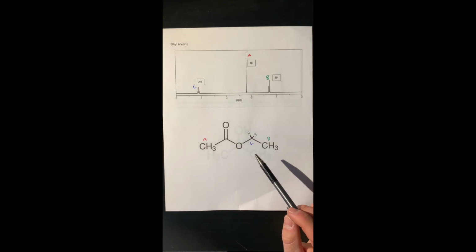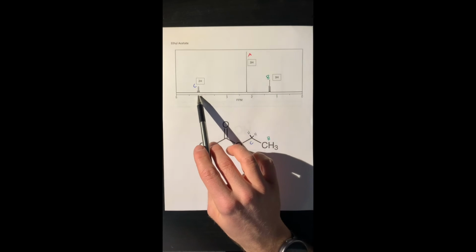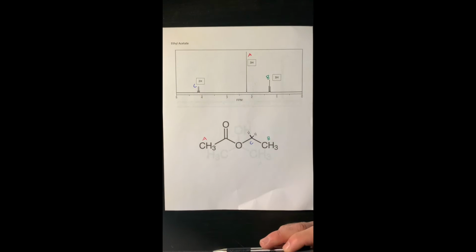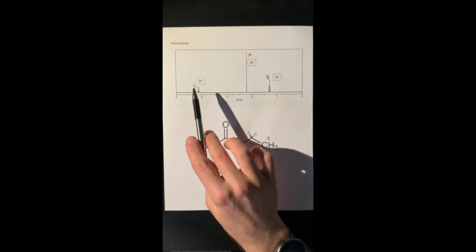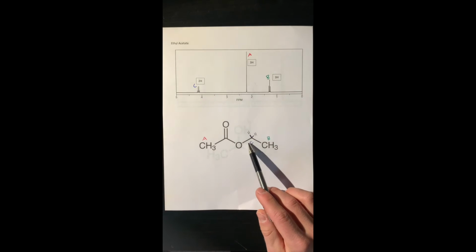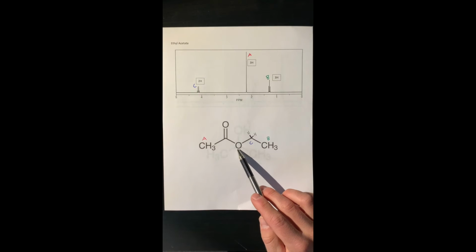And so the remaining signal here, this quartet just above 4 ppm, will also undergo first order coupling with this CH3 right here, and that's why it gives us 4 peaks. So this carbon here is what it belongs to. You can see the C and the C match up. And it is bonded directly to this oxygen, which is why it is pulled so far downfield.